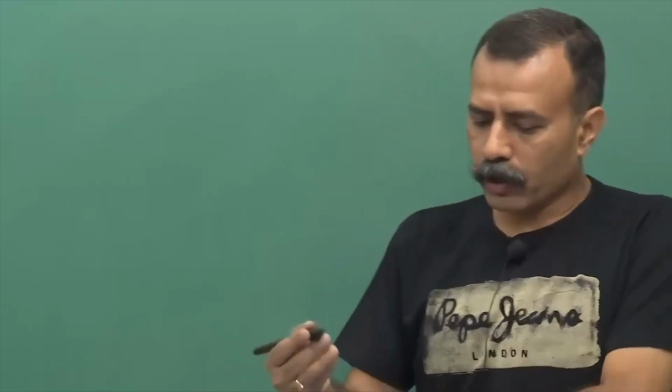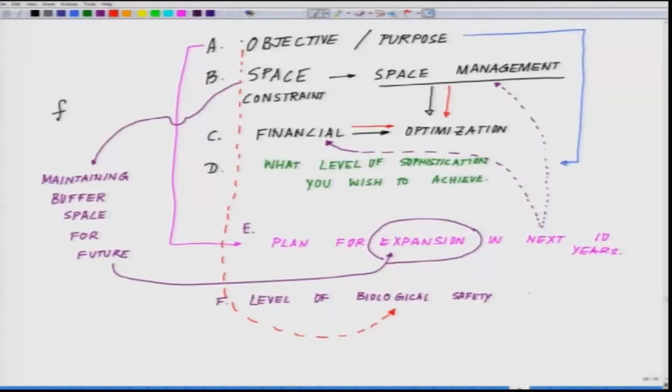have these levels called biosafety level 1, biosafety level 2, biosafety level 3, biosafety level 4. And for those who are a little inquisitive to learn about much of these dangers, should read a very nice book, The Hot Zone.